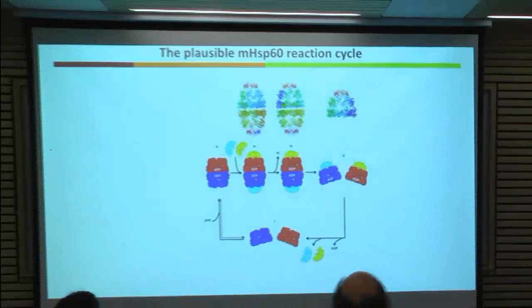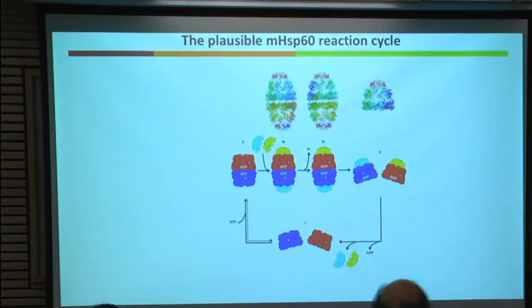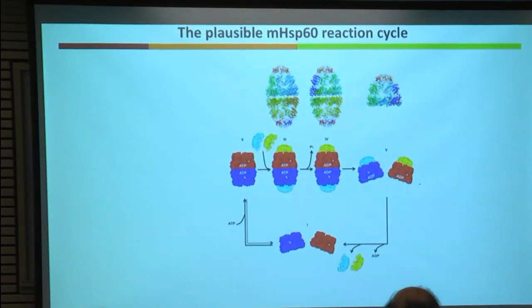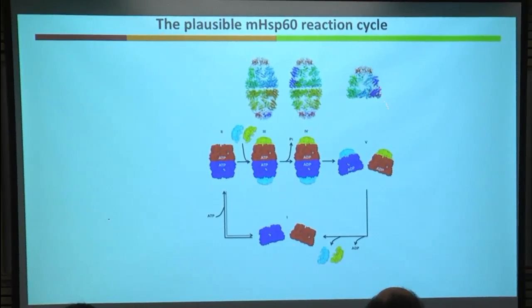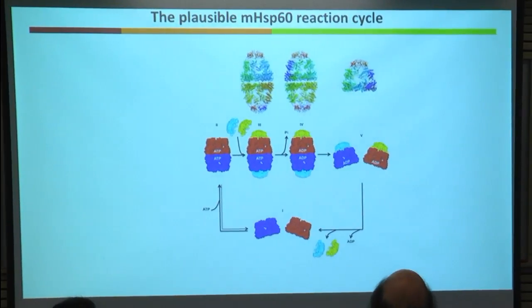HSP60 is a ubiquitous molecular chaperone found in all kingdoms and is distinguished into two groups. In our lab, we investigate the mechanism of action of the human mitochondrial HSP60 by crystallography and cryo-EM. We solved the structures of 3 different intermediates in the cycle of HSP60: the crystal structure of the football with ADP and beryllium fluoride, the cryo-EM of the football with ADP, and the cryo-EM of the half football with ADP.